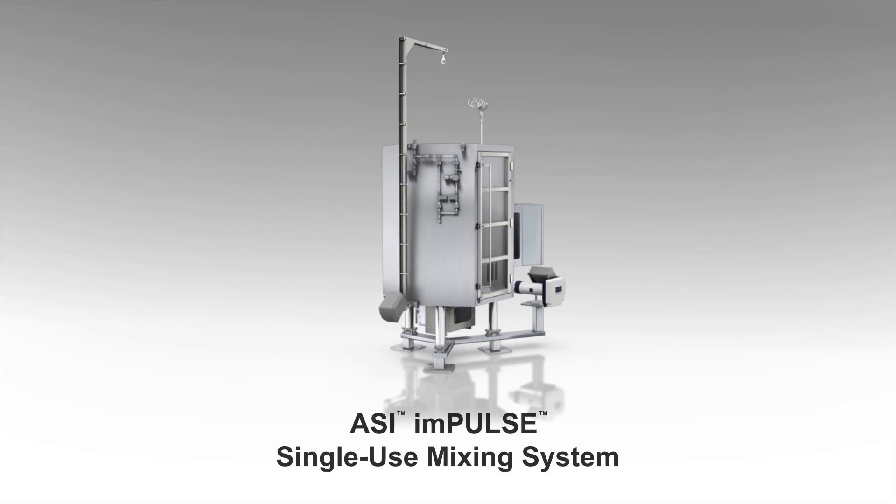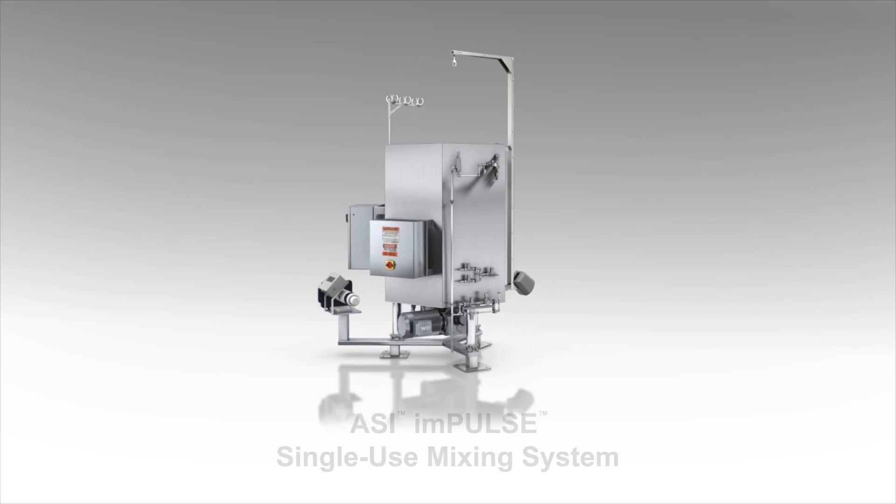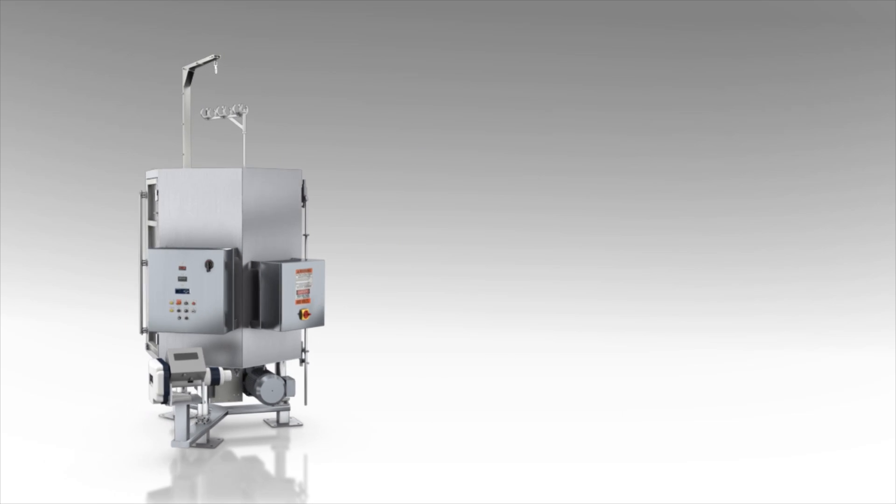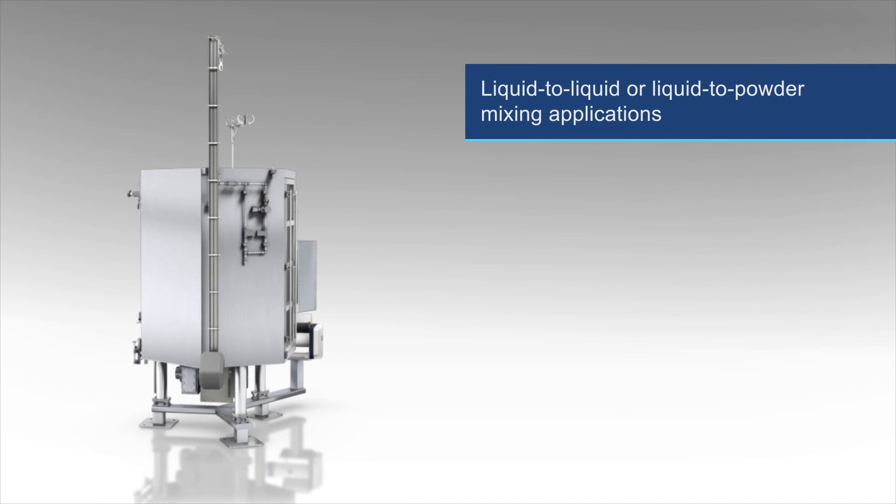Introducing the next-generation ASI Impulse single-use mixing system. The Impulse single-use mixing system is ideal for a wide range of liquid-to-liquid or liquid-to-powder mixing applications.